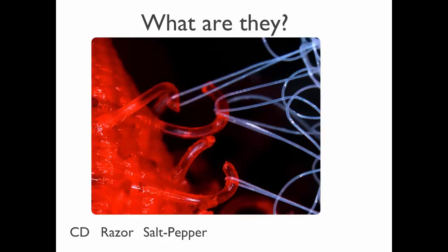This one you're gonna know. Velcro. What is that? Velcro, yeah. These are the hooks, the scratchy side of the Velcro, and these are the loops of thread that attach to it.